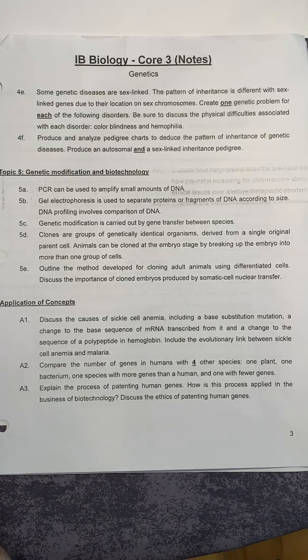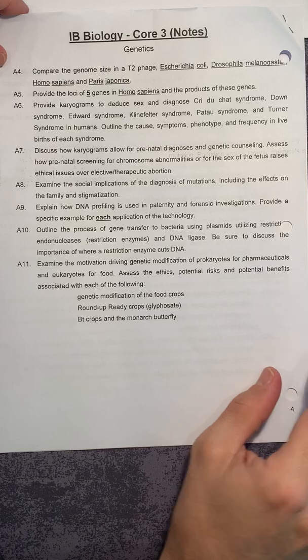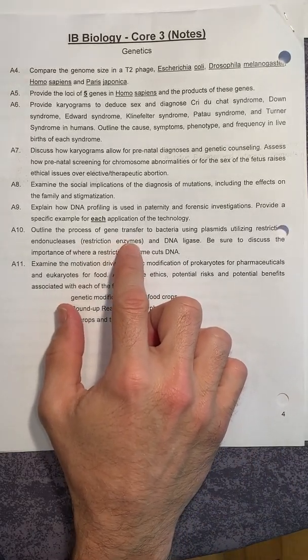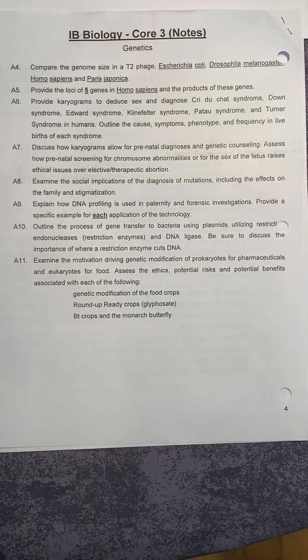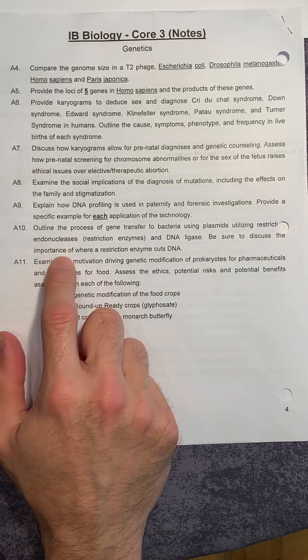Well, hello. Wanted to address your applications, especially application 10, in that this is a gene transfer for the bacteria. This is a lab that we were going to do a couple of weeks after the protein isolation, and COVID had other plans. So we will talk about this application now. We'll diagram it on paper, and then when we get back into the classroom, we will actually run this lab.